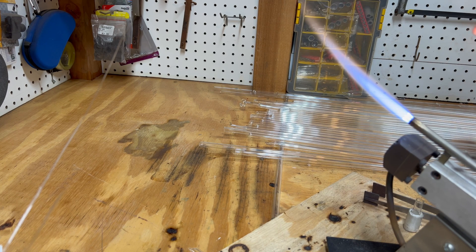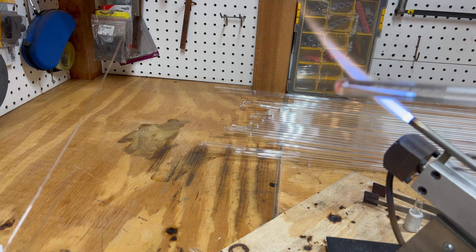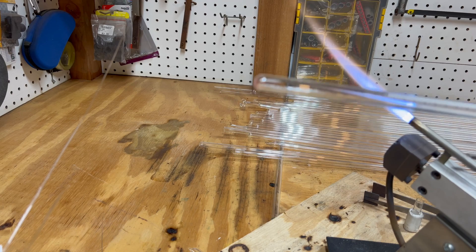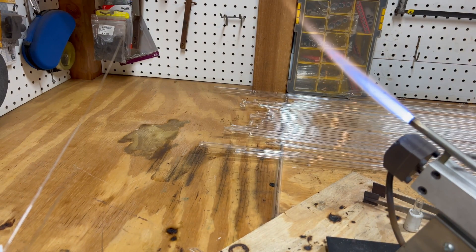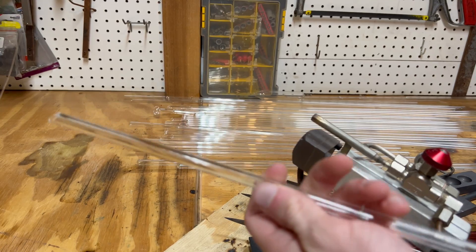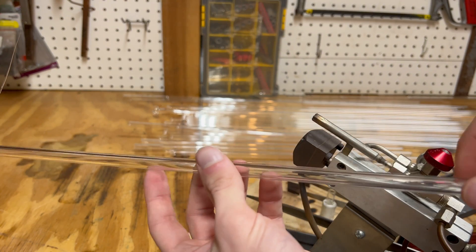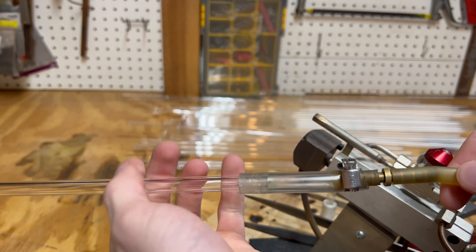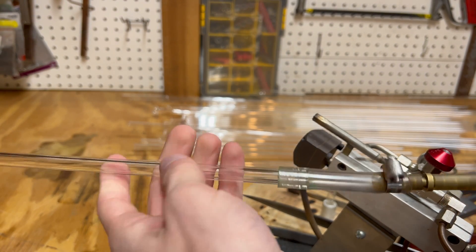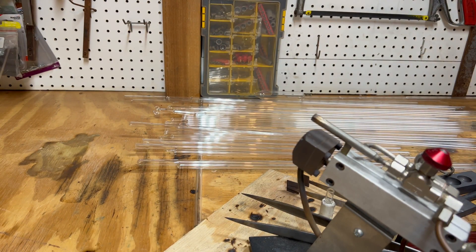We will begin by making a test tube. This step can be skipped if you're starting with a test tube. They are quite simple to produce and allow you to practice skills that are used in almost every glass working project. There are many methods to produce a test tube. With all of them, you're going to need to begin with a length of tubing. It's helpful if one side has already been fire polished, as this makes it safer and easier to work with. Next, attach the blowhose assembly to the polished end.